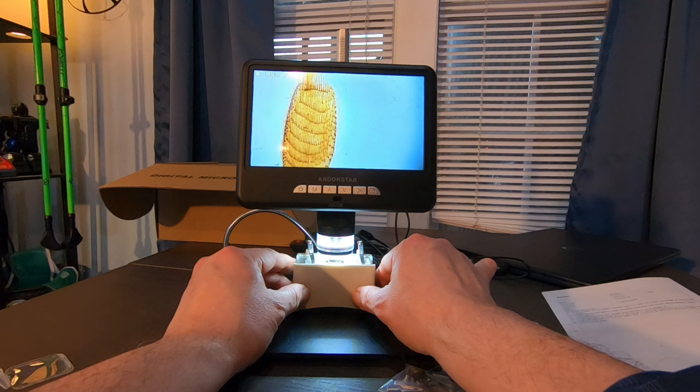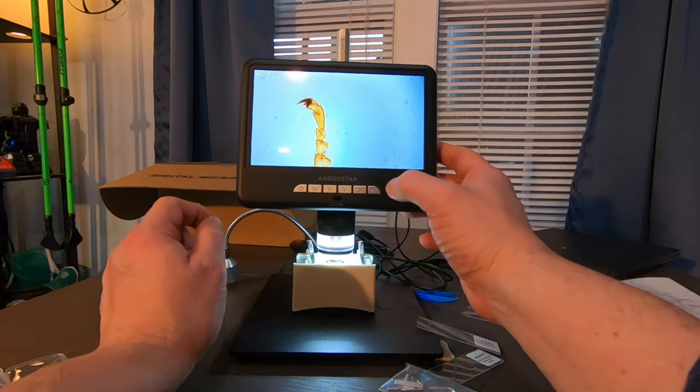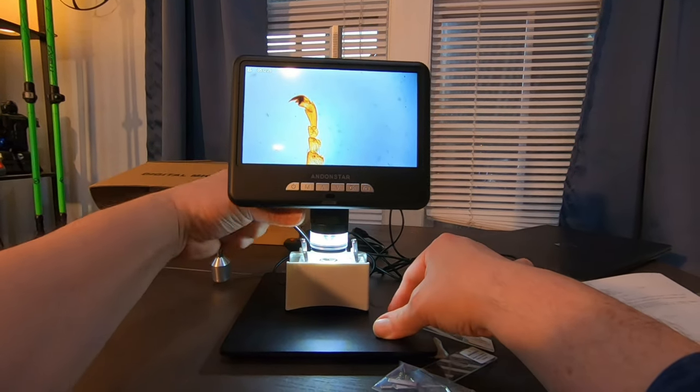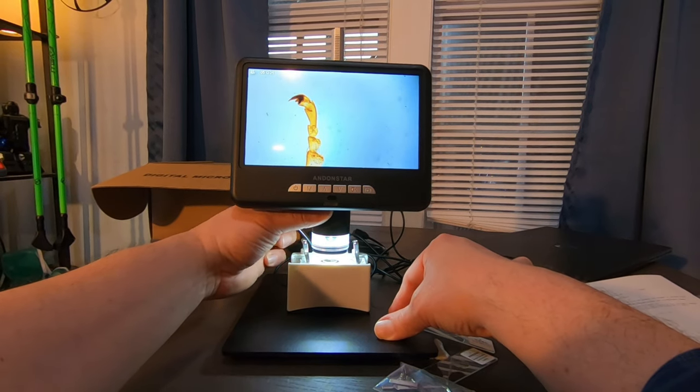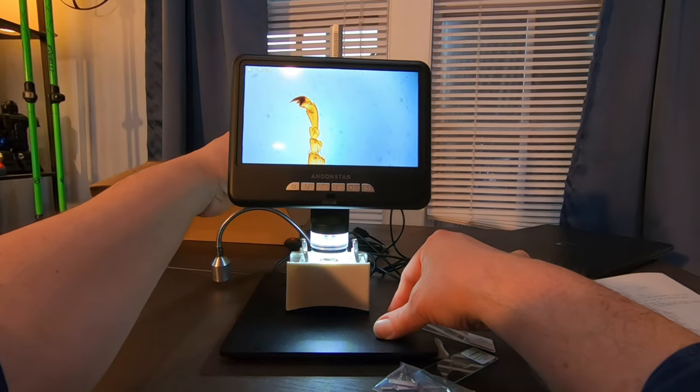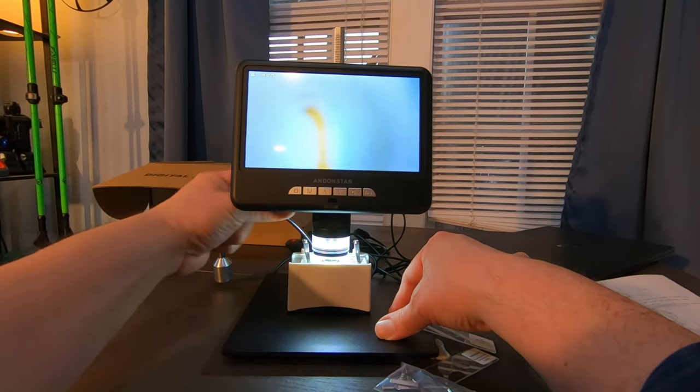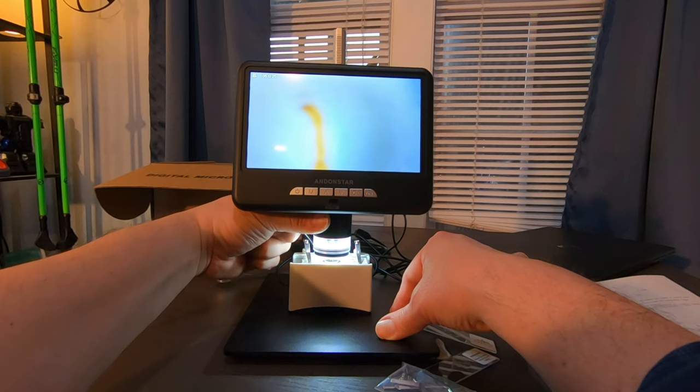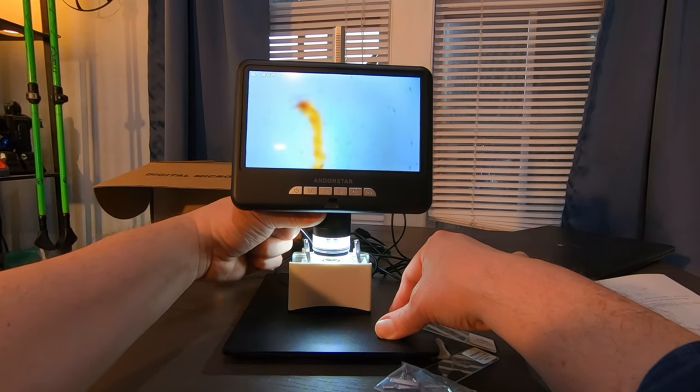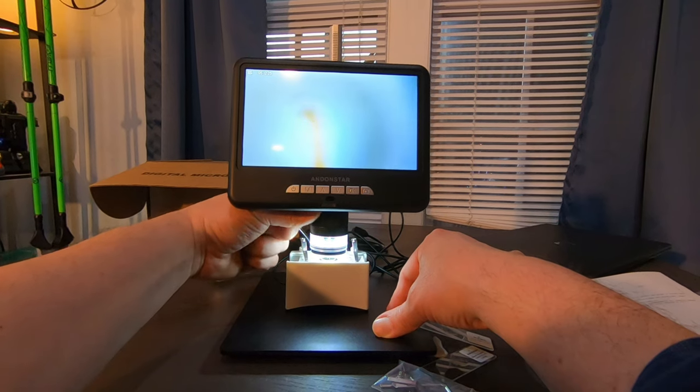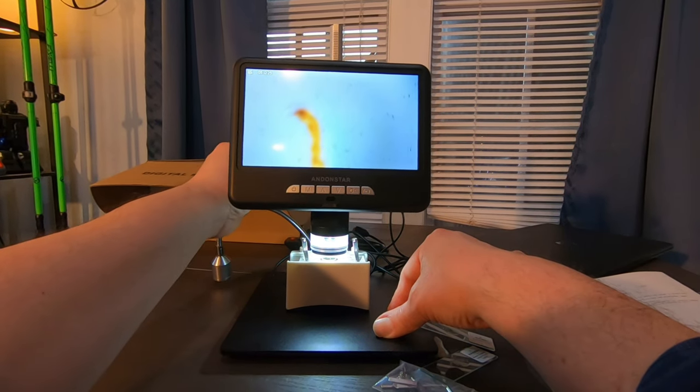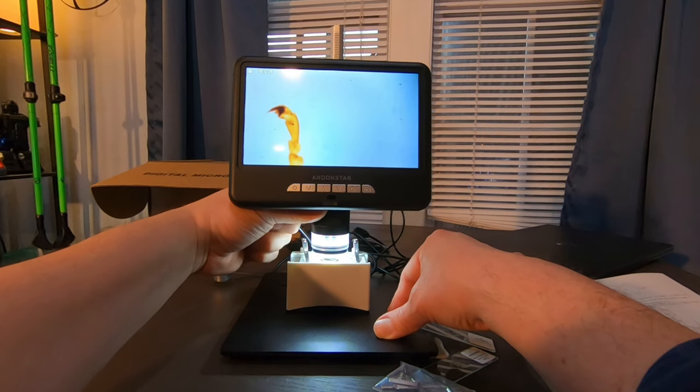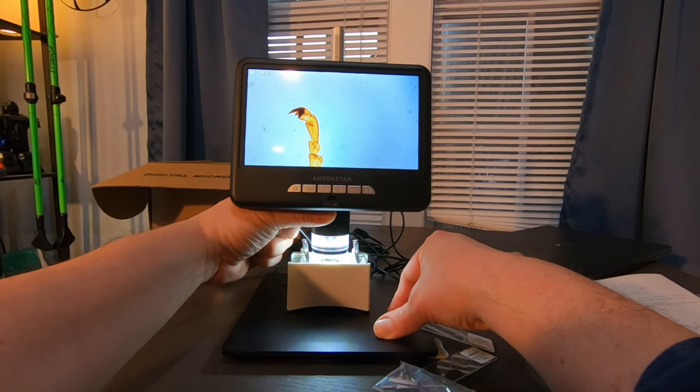And I have an SD card in here. Looks like I have it all as sharp as I can be. Let's see. Can I make it sharper? Yeah, it's pretty good. Can I bring it closer? Let's see if I can get closer. Okay. And then I'll sharpen it. It might be as sharp as I can get. Okay, that's as close as I can get. All right, so let's go back out. Let's get out. And now we'll just show. I guess there is a limitation, I guess, with the sharpness. But that's kind of cool. Look at that. So this is going to be great, guys and gals.